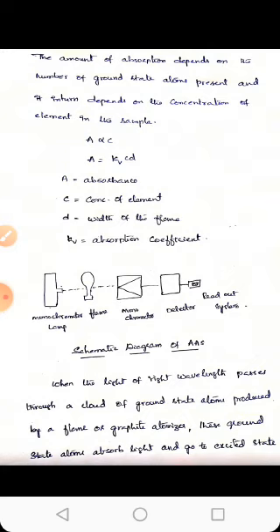So this is the schematic diagram of atomic absorption spectroscopy. It consists of a monochromatic lamp and the light passes to the flame. When it passes to the flame, the atoms are in the ground state, which absorbs energy and goes to the excited state. After excitation, it absorbs some amount of the energy, which is detected in a detector, and which gives the signal.